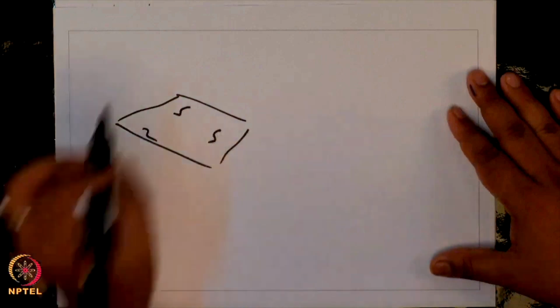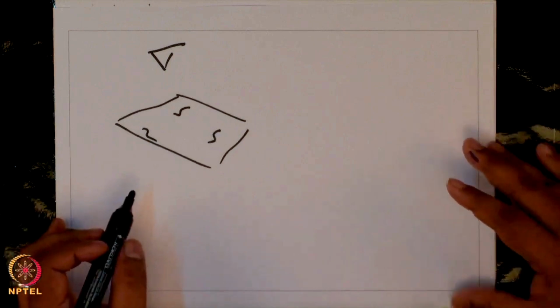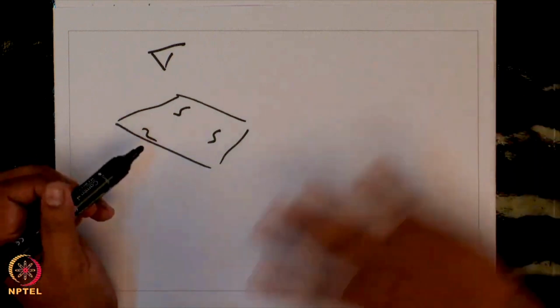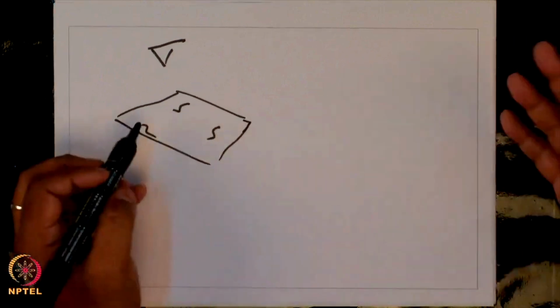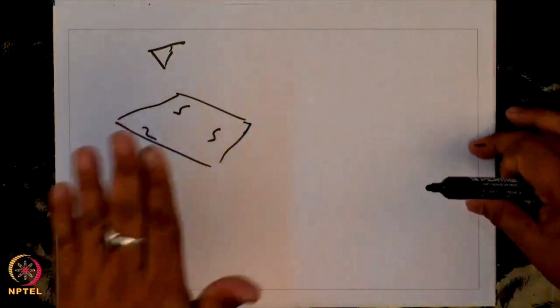Now, going back to this picture, you have these proteins which are passively adsorbed onto the surface. You cannot visualize these proteins under the AFM unless you do an imaging of the surface. Proteins are below the optical detection limit, so you cannot see the proteins on the surface and position the tip on top of a protein. So, like a blind man, you are just tapping the surface at multiple different positions with the hope that something will come up. How do you know that you have actually touched the protein in one such pulling cycle?